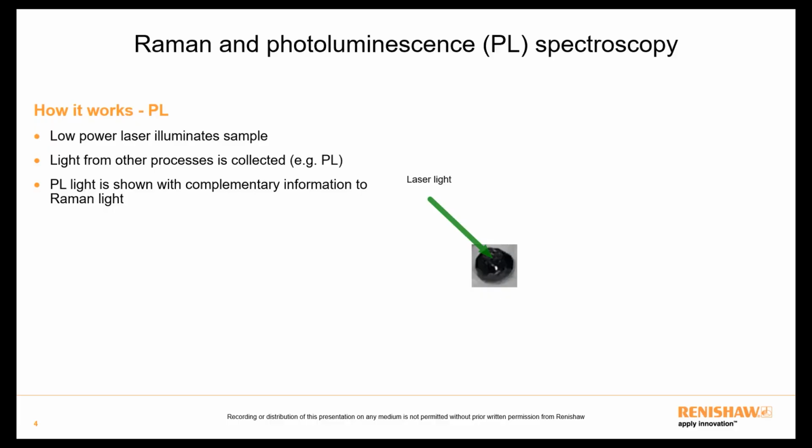As well as producing Raman data, it is possible for some Raman systems to collect photoluminescence, or PL. Conveniently, this process uses the same laser source. This time, light re-emitted by the material is collected at any wavelength higher than that of the laser.